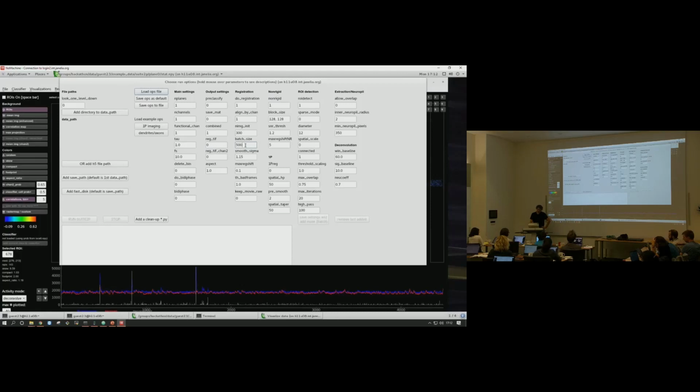It probably doesn't make sense to increase it much more than that. That's how many frames at a time it's going to register. Would 1,000 frames be faster than 500 if your memory can handle it? There'll be scaling up to some point after which it will plateau. I think it plateaus around 1,000 or so.